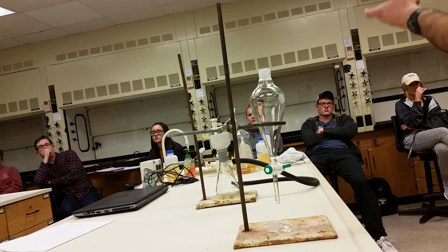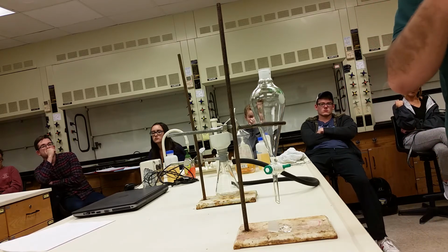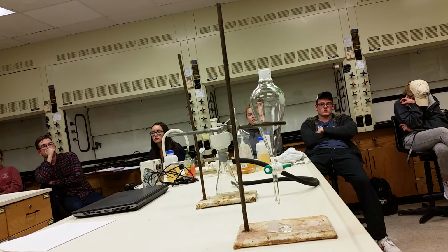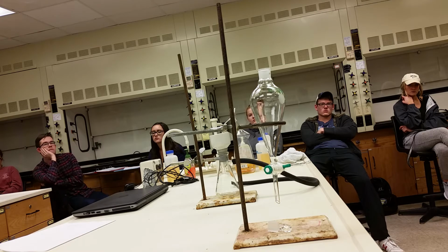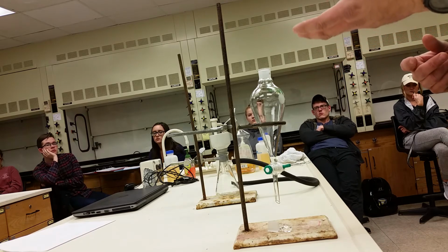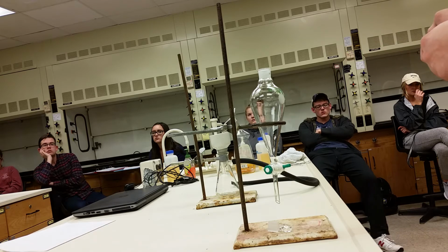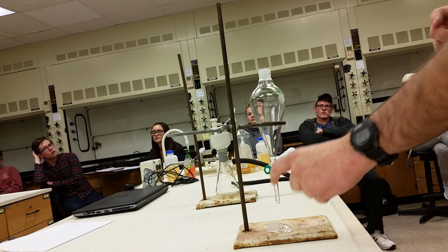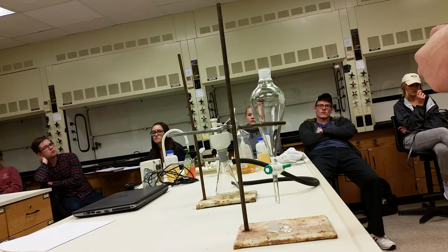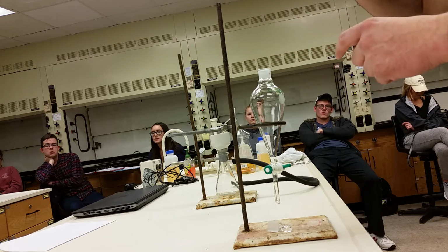So you get a piece of filter paper and the glass funnel. Put the filter paper in the glass funnel and fold it, like you've done before in the past when you did the separation of a mixture lab in 111. Put a pre-weighed 50 milliliter beaker underneath the funnel. Pour your stuff through.